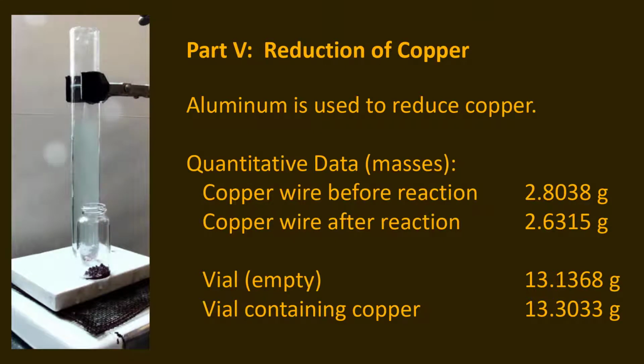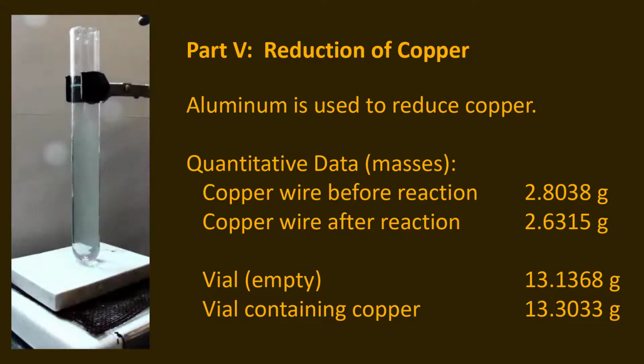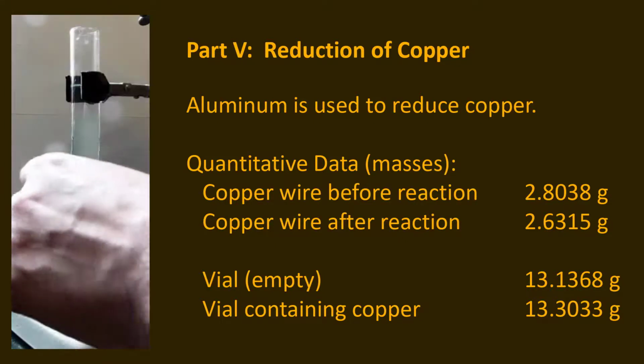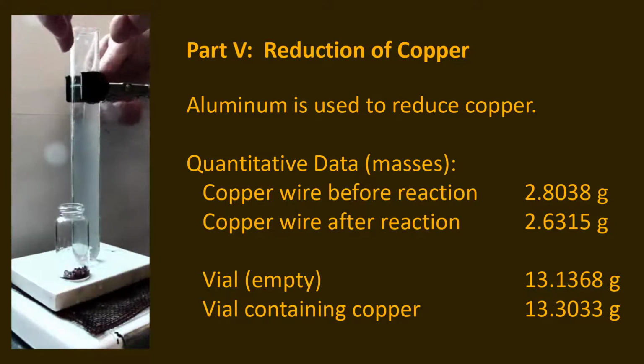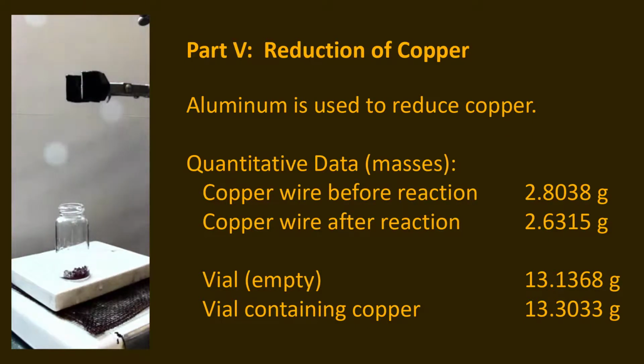So the hope is that we end up with our product that's wet, but is now covered mostly with a mixture of organic solvents as opposed to water. Now this can go away because it's all done.